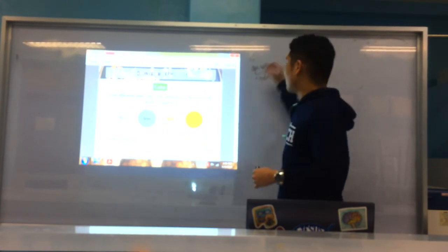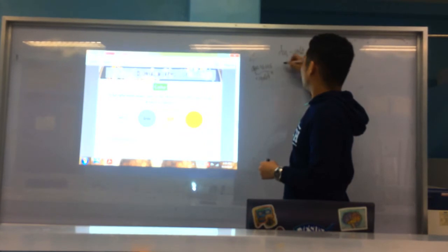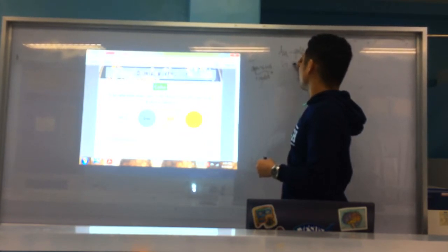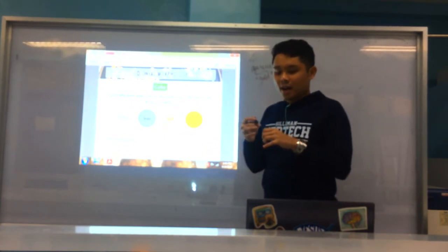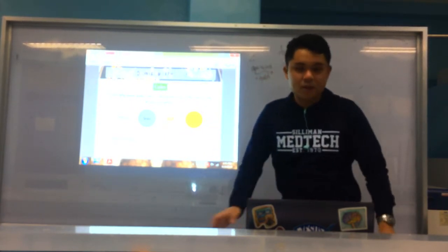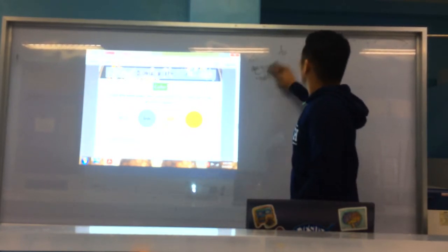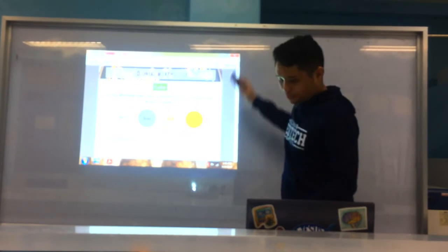In Latin, your chemical symbol of gold is Au. And Au in Latin means aurum. So aurum, aureus, that's why the color is gold, yellow, buttery looking. So that's for Staph aureus. Gold, aurum, Au, gold. Okay, all right.